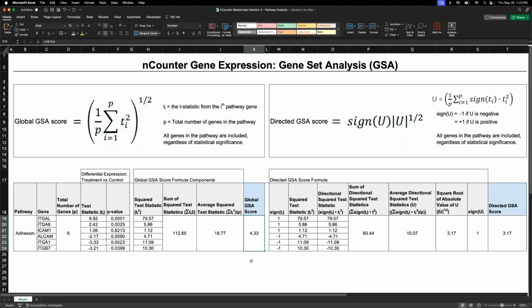It's very simple in terms of the math, but this nomenclature, this representation can be quite daunting if it's not easily understood and interpreted. So let's look at this global score here, 4.33. This is kind of the average value of all of our squared T statistics. The key here is that this is global, so we're not taking into account the direction. We're not looking at, is the gene upregulated? Is the gene downregulated? Are these T's positive, or upregulated? Are they negative, or downregulated? We're squaring these values. So if you remember, we square all these T's, so everything becomes positive.